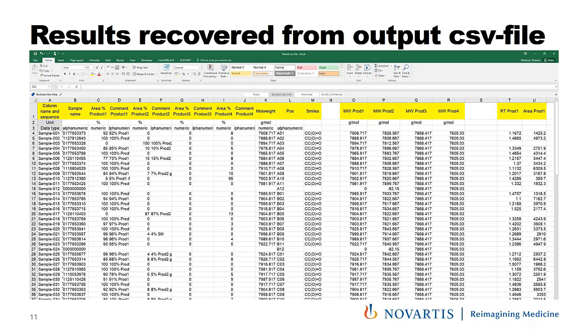So both the input file as well as the output files are totally customizable, and I'm pretty sure the programmers from Mestre Lab can help you to integrate the sort of in and output files that best fits your needs.